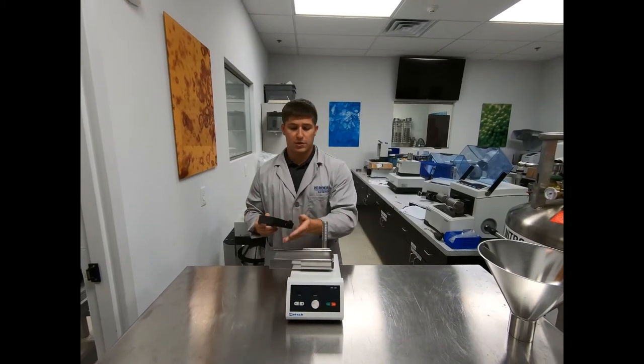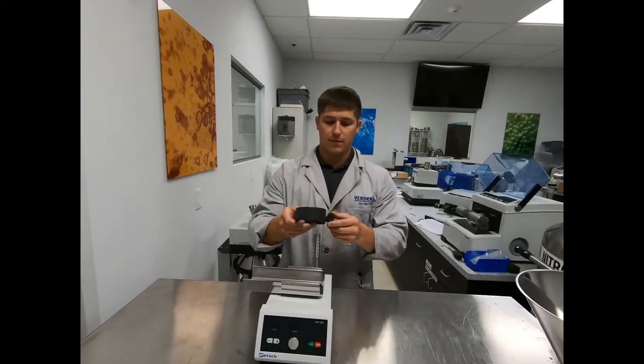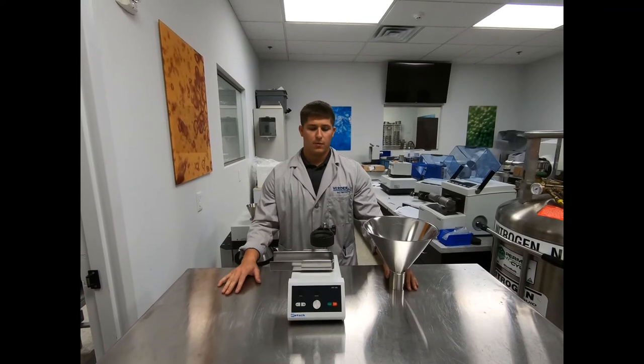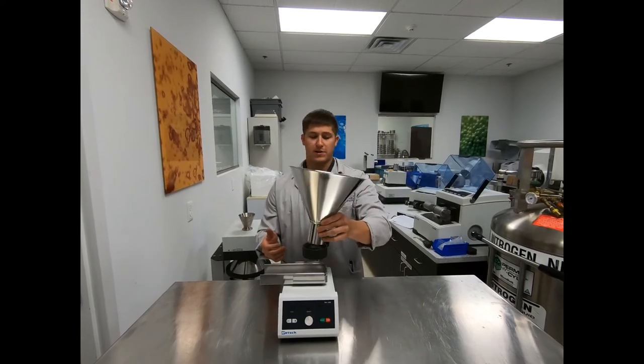Once your push feed chute is installed, the next step is to install the fixture onto the mounting rod of the drive unit. Once your fixture is fully installed, the last step is to place the actual hopper into the fixture itself.